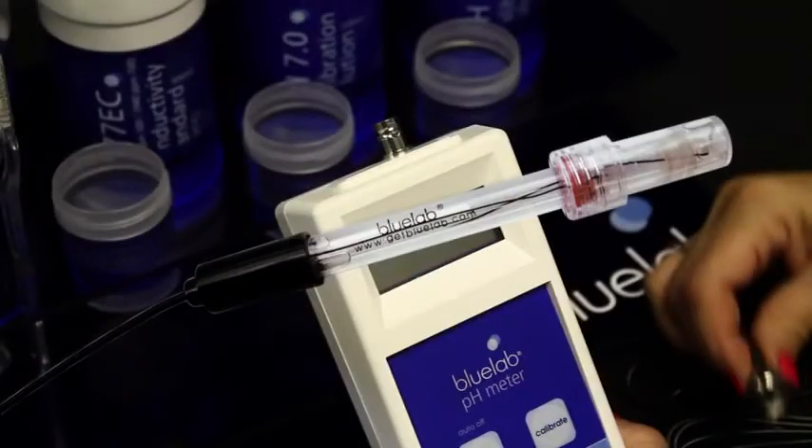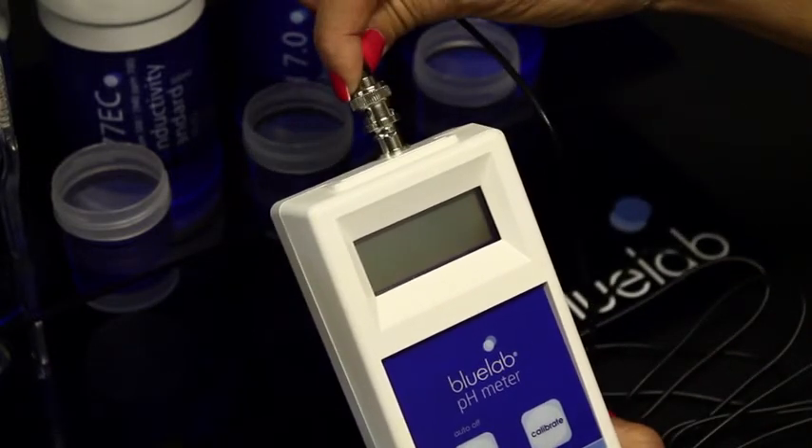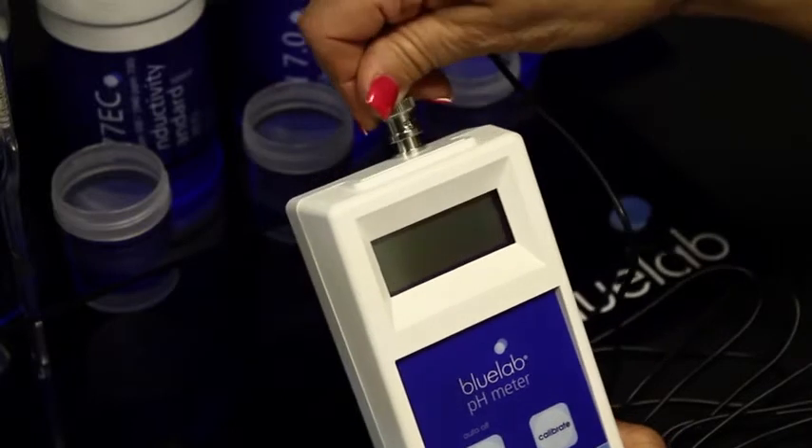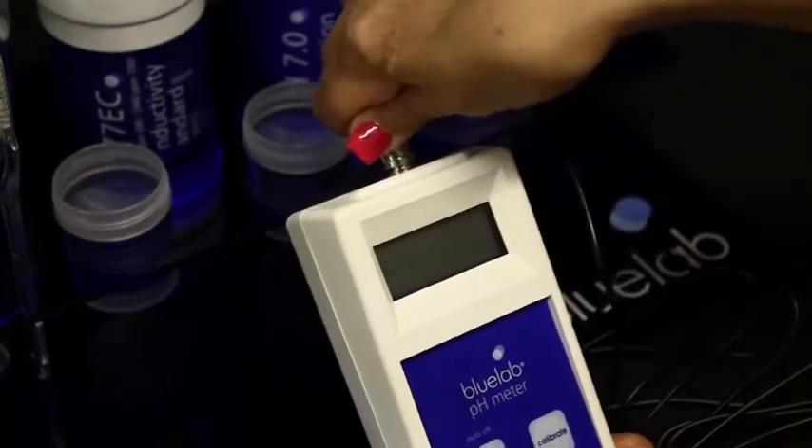Start by removing the replaceable pH probe from the box. Connect the pH probe to the pH meter by lining up the lugs of the BNC fittings. Fasten securely by pushing the pH probe connector on and twisting one quarter turn.